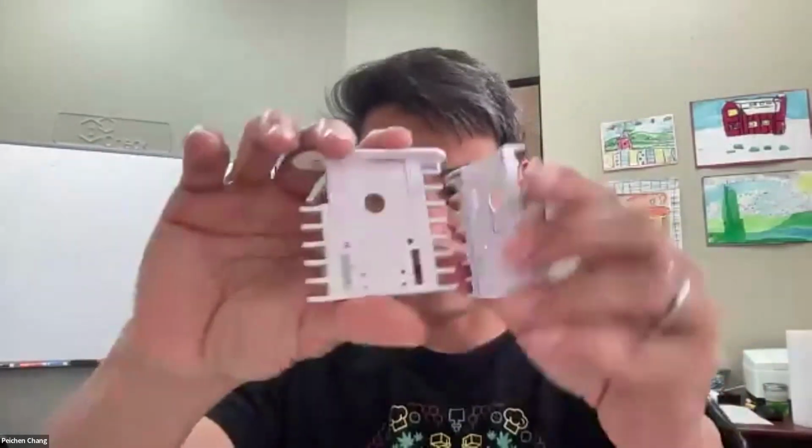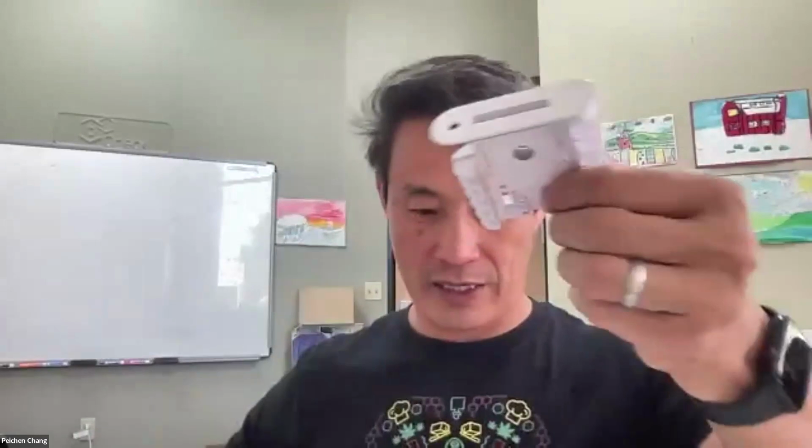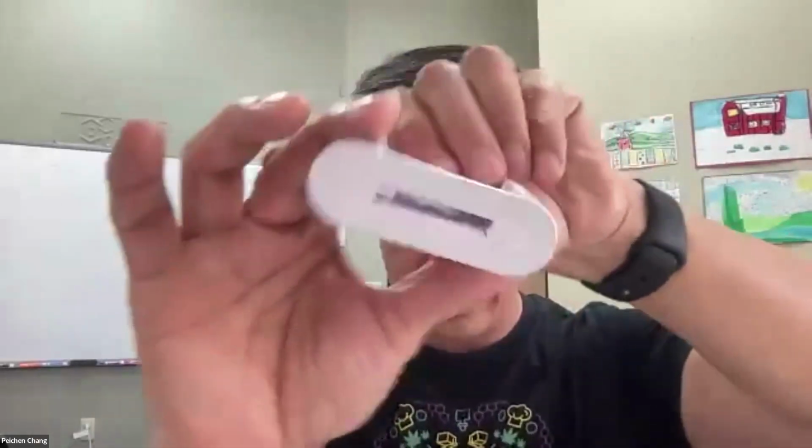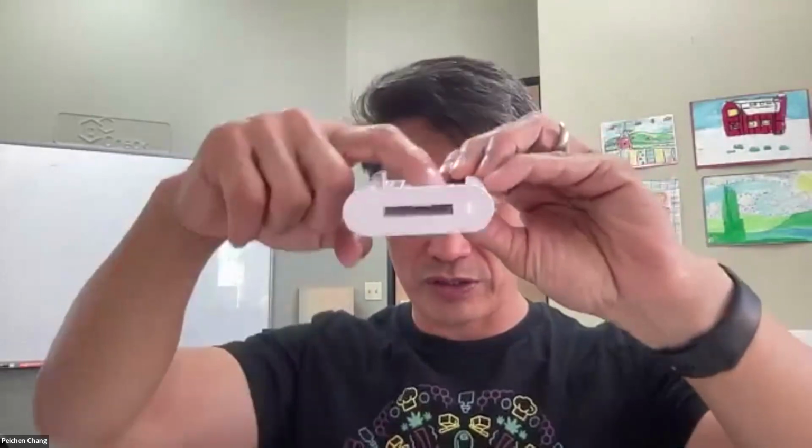If a little bit of stuff happens to get squeezed out of the tray and into the slot itself, you can actually clean it with a Q-tip and a little bit of alcohol, and it'll wipe out. But if you happen to get oil through those little holes and onto electronics, unfortunately, we do have to recalibrate the thing.